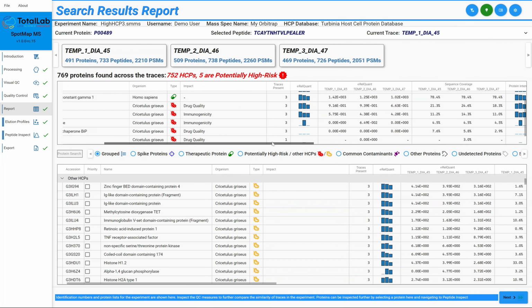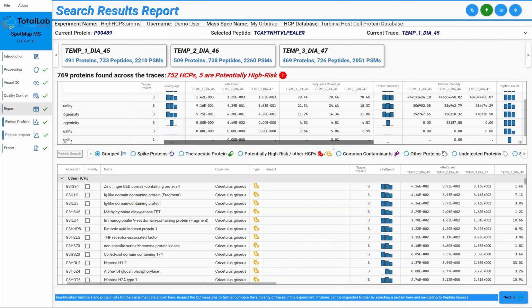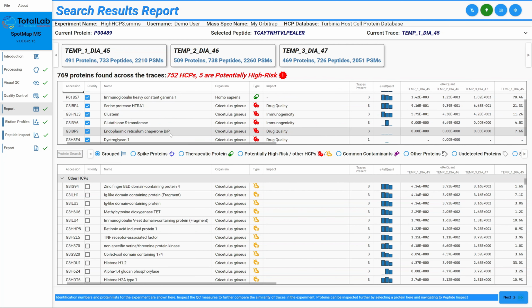But again, when it comes to the manual step, you might, as the operator, choose to exclude that, and you absolutely can do that. But straight away, we flag it up like, hey, there might be something here.